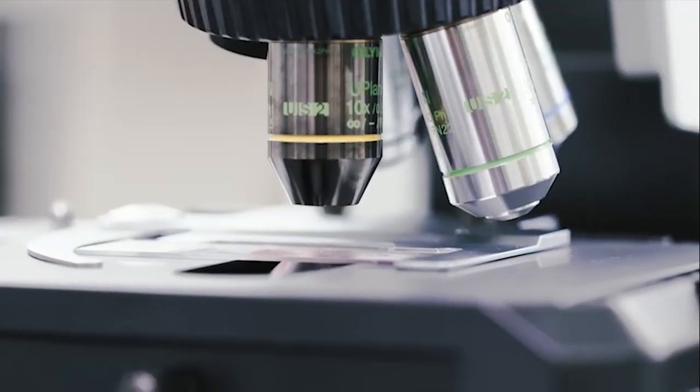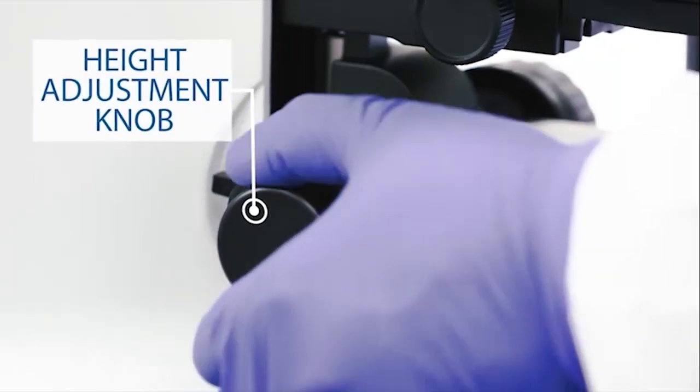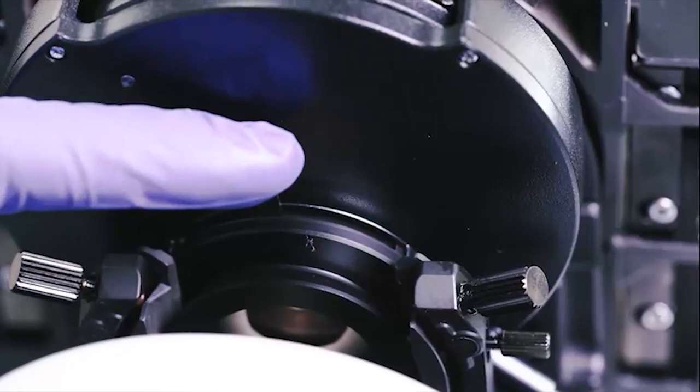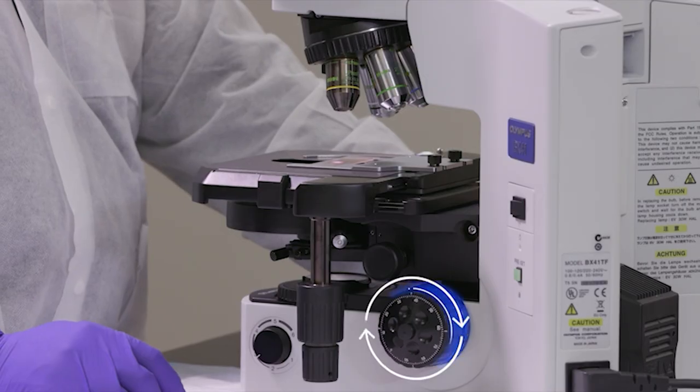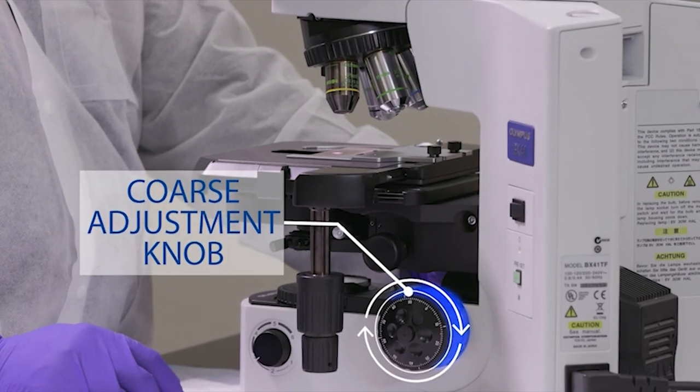Move the stage as high as possible with the height adjustment knob. Close the field diaphragm halfway and focus on the specimen at 10x using the coarse adjustment knob.